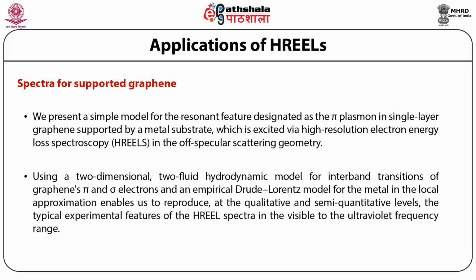A two-dimensional two-fluid hydrodynamic model for interband transitions of graphene, pi and sigma electrons, and an empirical Drude-Lorentz model for the metal in the local approximation enable us to reproduce at the qualitative and semi-quantitative levels the typical experimental features of the HREELS spectra in the visible to the ultraviolet frequency range.